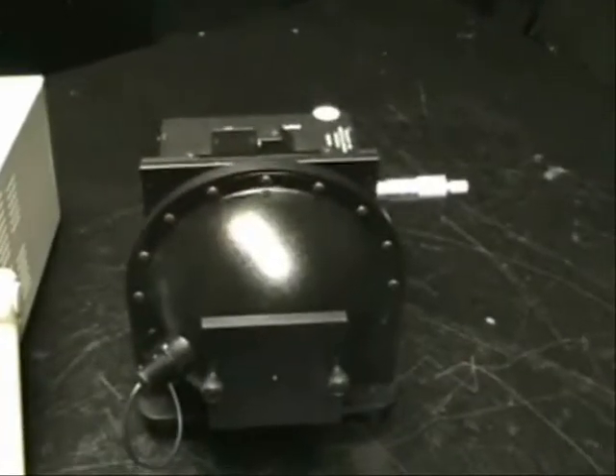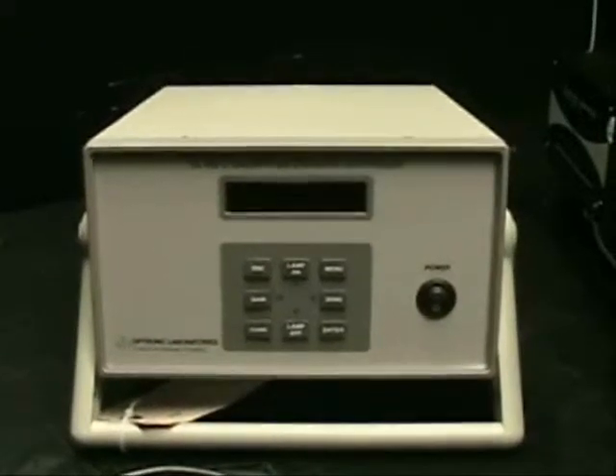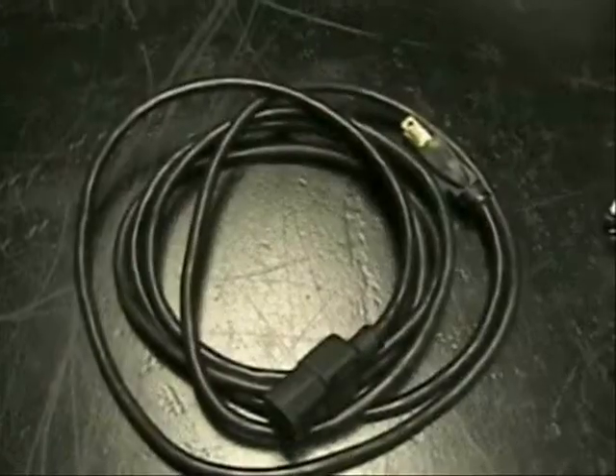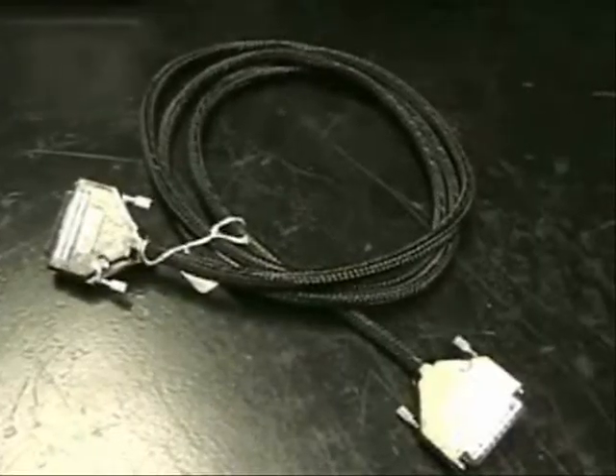After unpacking the unit, you will find essentially four separate items: the optics head, the OL400 controller, a power cable, and a communication cable.